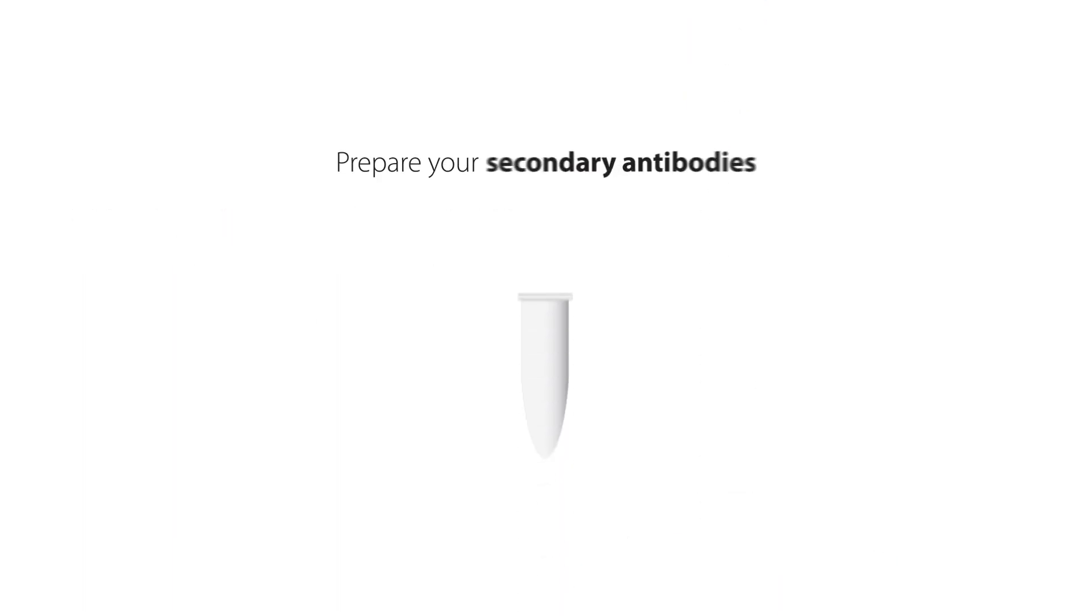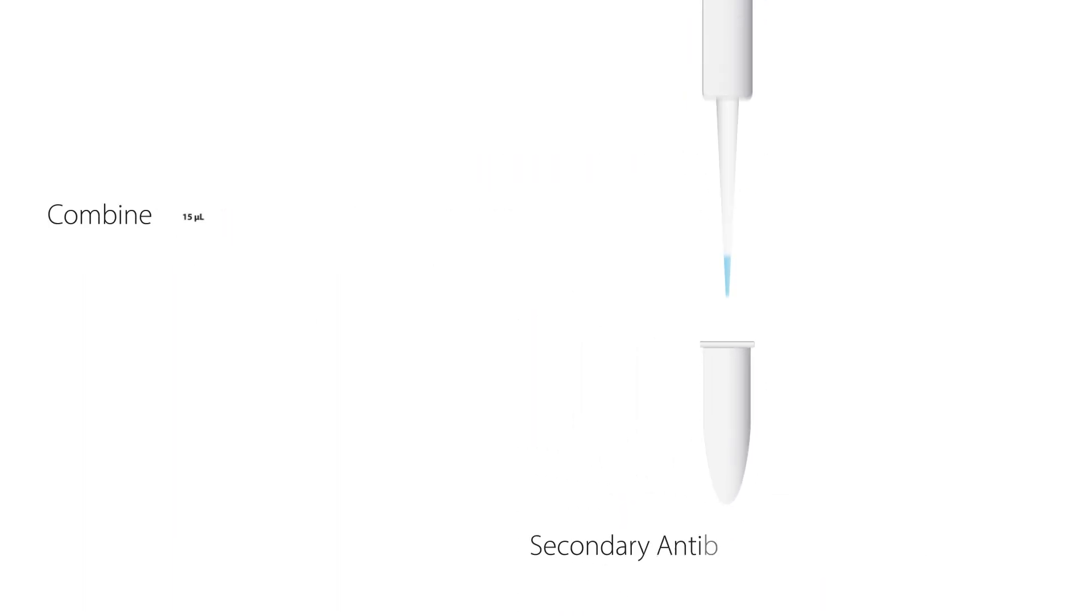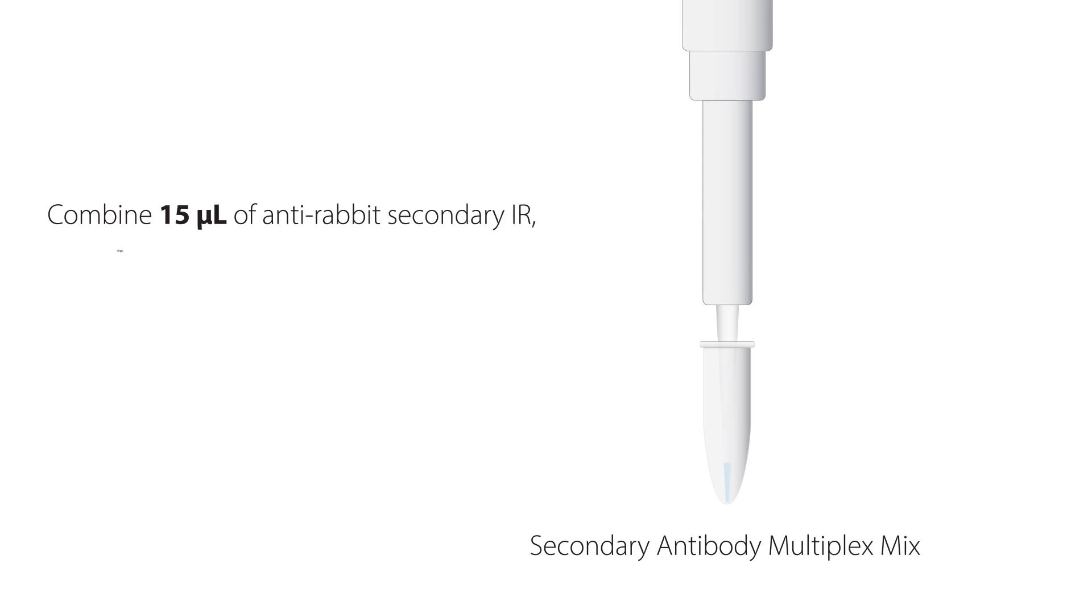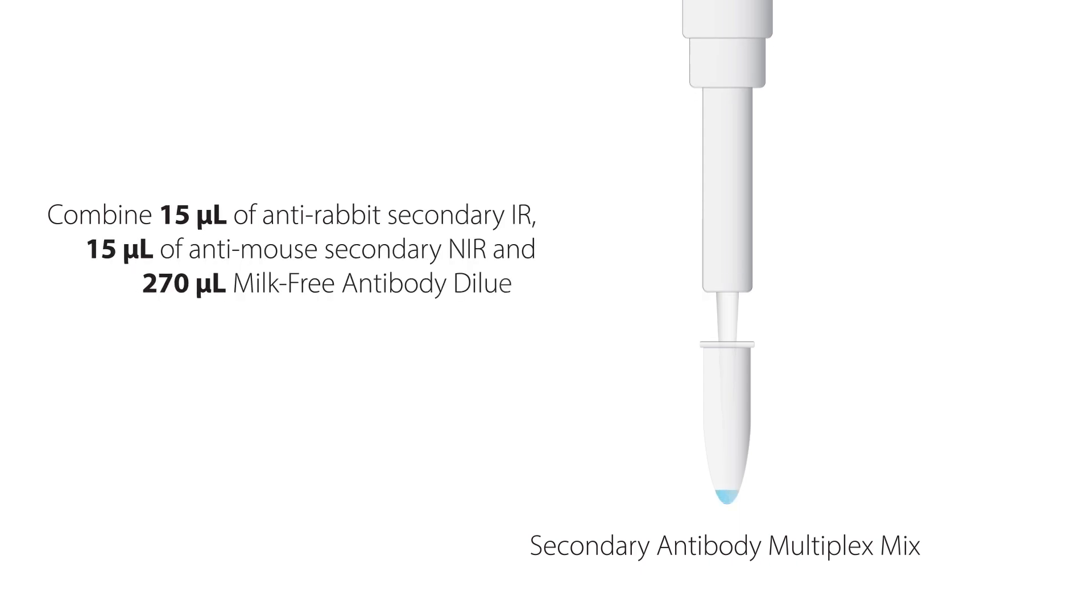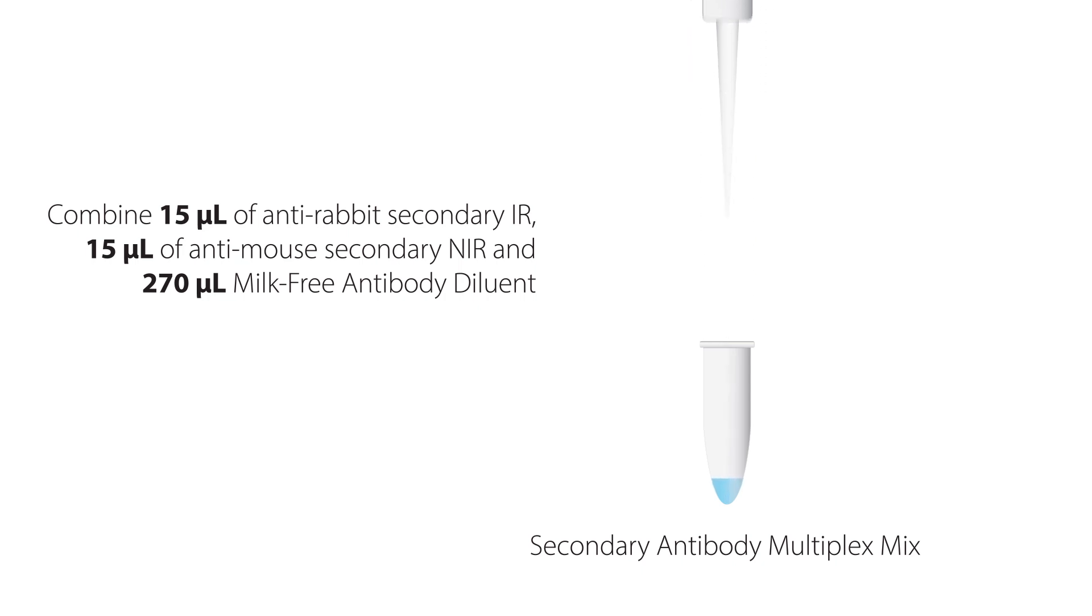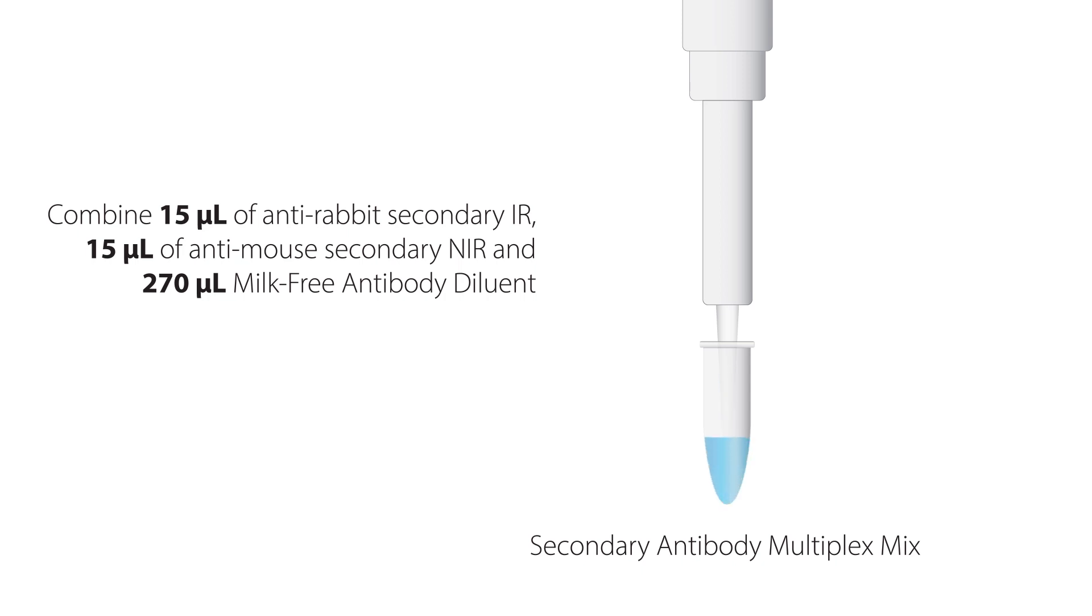Then prepare your secondary antibody multiplex mix. Combine 15 microliters of anti-rabbit secondary IR antibody, 15 microliters of anti-mouse secondary NIR antibody, and 270 microliters of milk-free antibody diluent. Mix gently by pipetting.